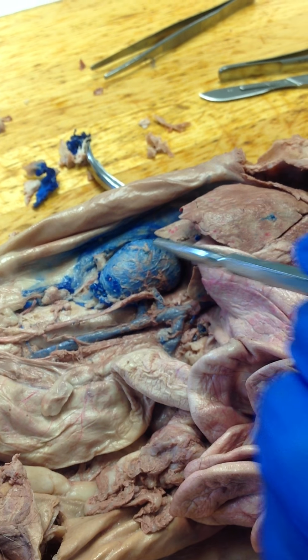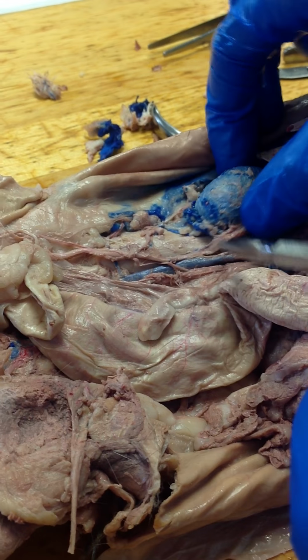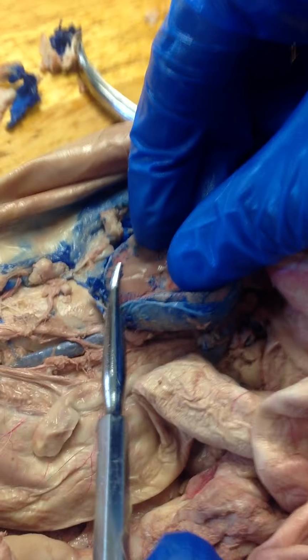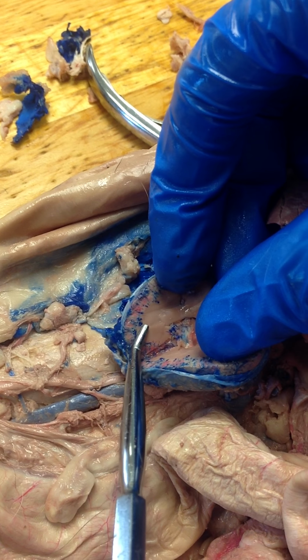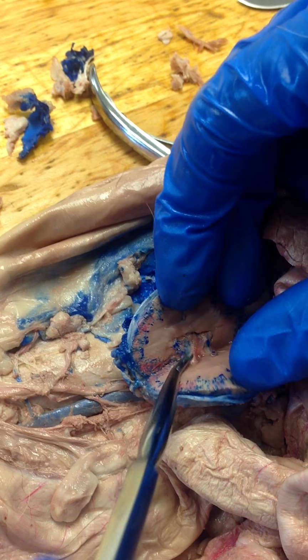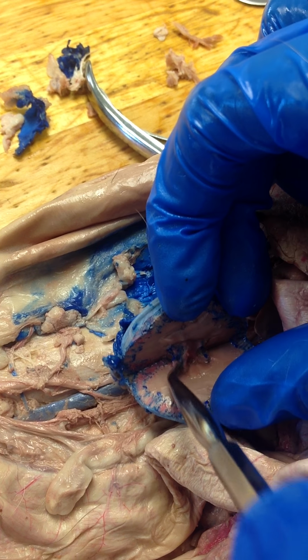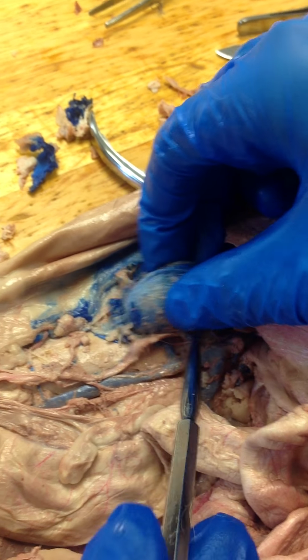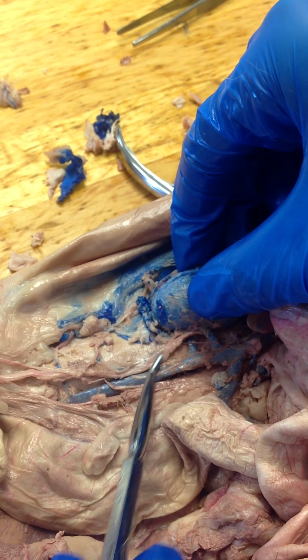Behold the kidney. The ureter comes out of the kidney and runs down here. If we open up the kidney, you can see the renal cortex up top, followed by the medulla, followed by the papillae, and then there's this sort of gap here, that's the pelvis. It's where all the stuff meets, and that connects to the ureter.